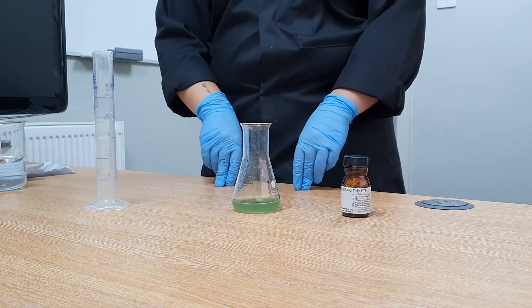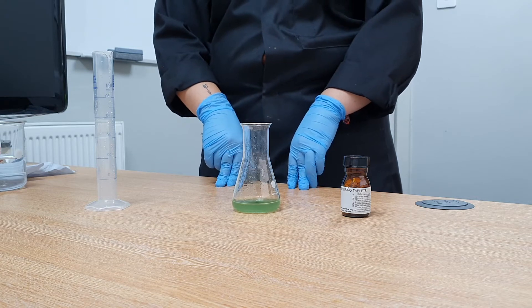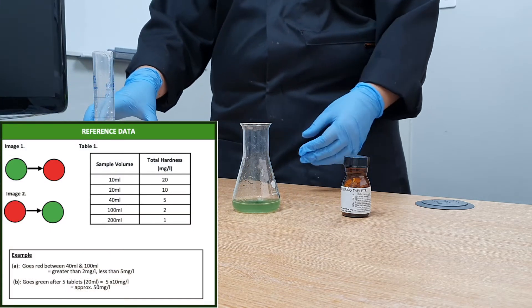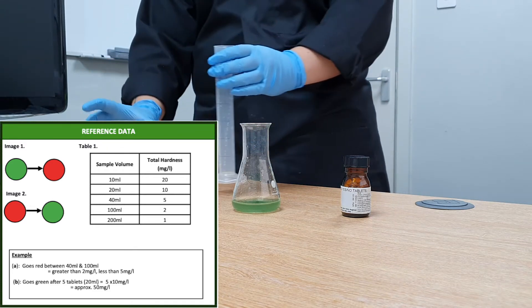If a green colour develops the total hardness is less than 10 mg per litre. Continue to add more 20 ml of sample following the increments shown on the method sheet until the colour changes to red.